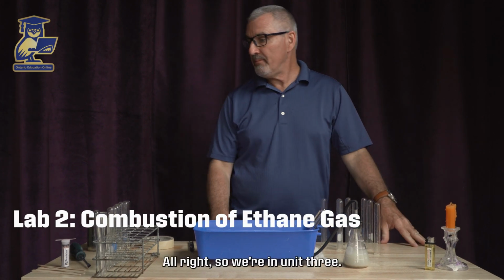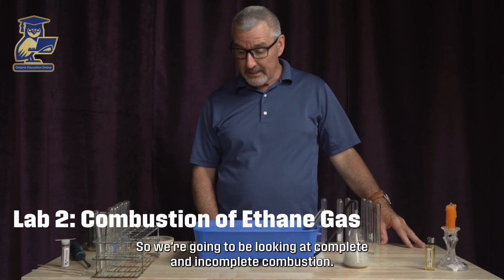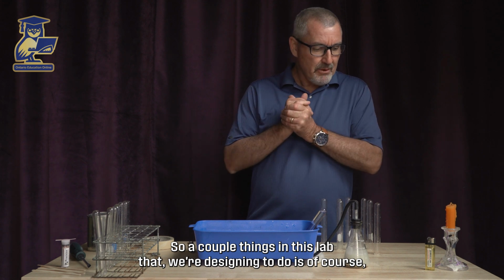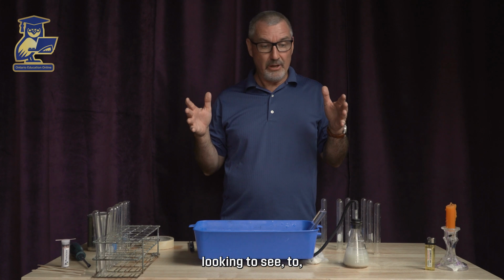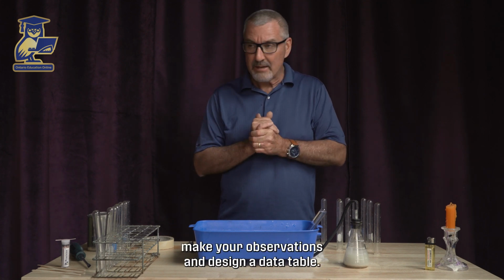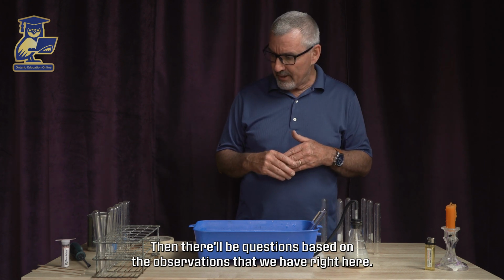So we're in Unit 3, and this is the first lab where we're starting with hydrocarbons. We're going to be looking at complete and incomplete combustion. A couple of things we're designing to do in this lab is, of course, making your observations and designing a data table. Then there'll be questions based on the observations that we have right here.